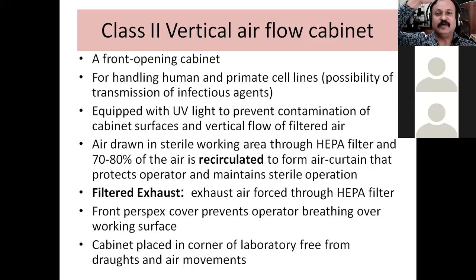So there is one-time filtration at the top, second-time filtration at the bottom. And again that air, filtered air, is coming at the top, so there is third filtration and fourth filtration and so on. So the same air, when it is recirculated, the chances of having a really clean environment in the biosafety cabinet is actually assured, isn't it?